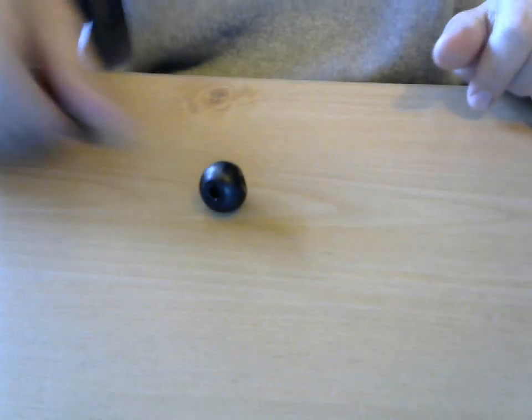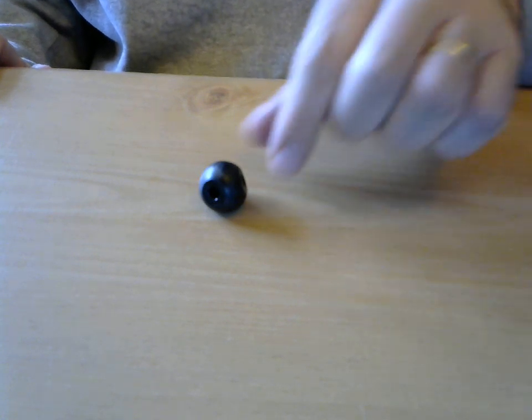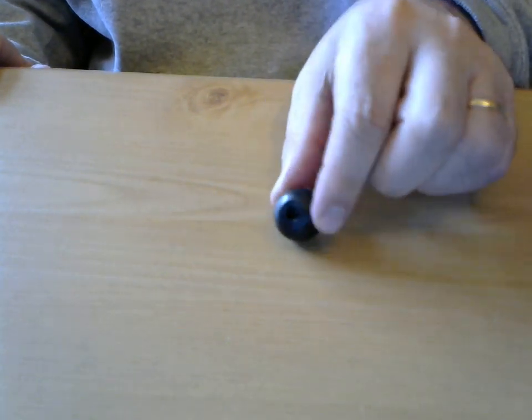Okay, so I want to go through real quick what you need to know to make sure this lab is successful, and then I'm going to do 1 page per video. All right, so first thing you need to know. Black sphere is carbon. So write that in that page. The black sphere is carbon.